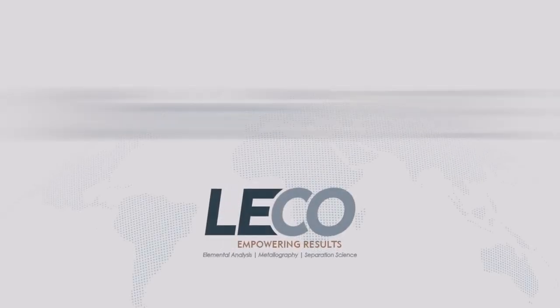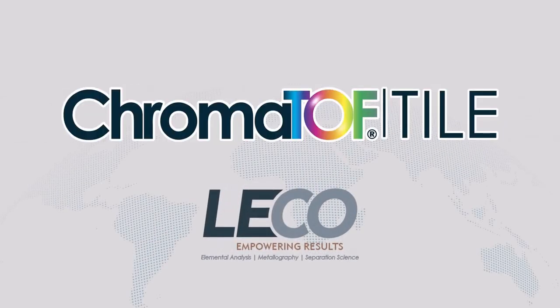Leco's ChromaTOF Tile is a powerful software tool that can streamline data analysis and help researchers dig deeper into their GCGC data to efficiently find differences.